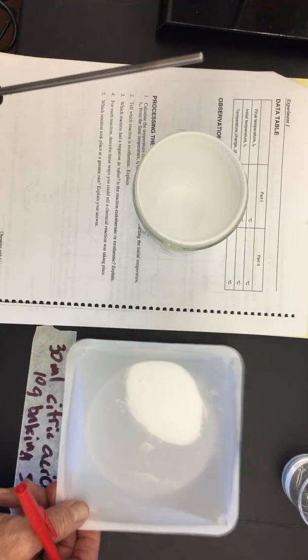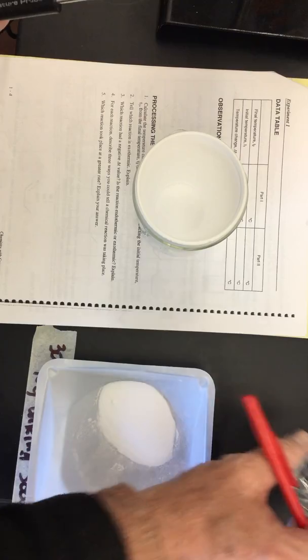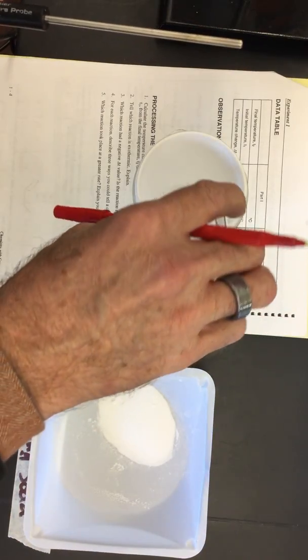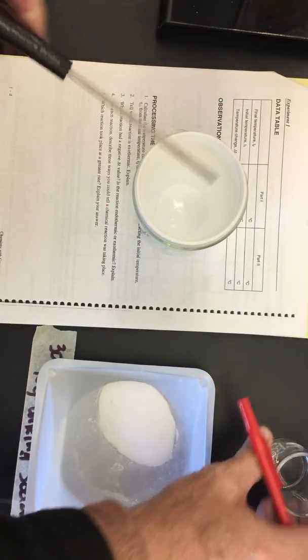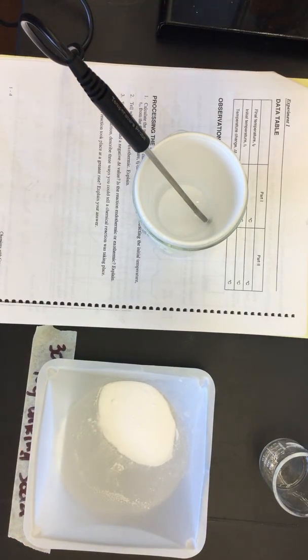I'm going to be taking the baking soda here, and I'm adding it to the citric acid. And so here's the citric acid. I'm just going to put this in the cup. No reaction has taken place yet. This is just going to be sitting there monitoring the temperature.